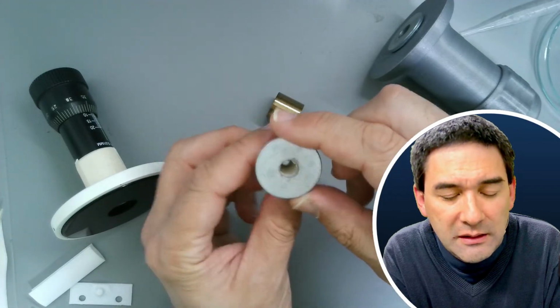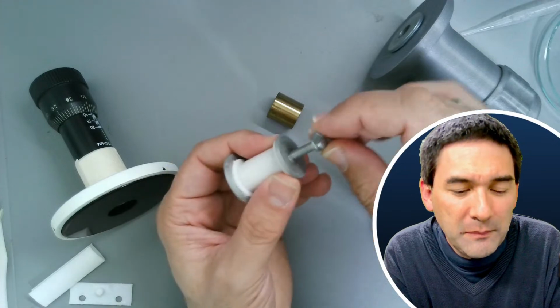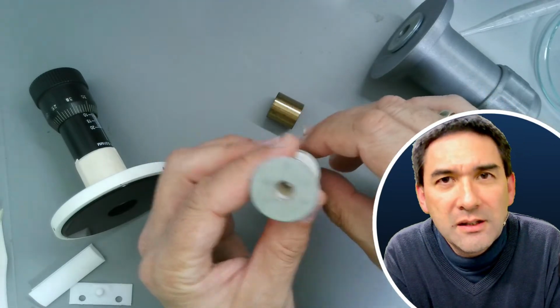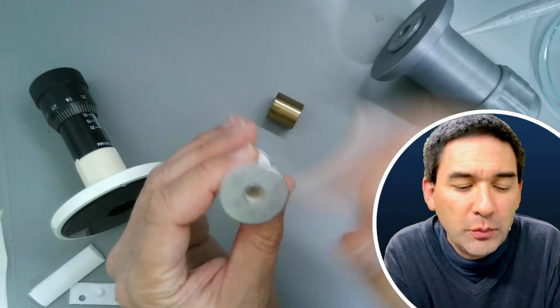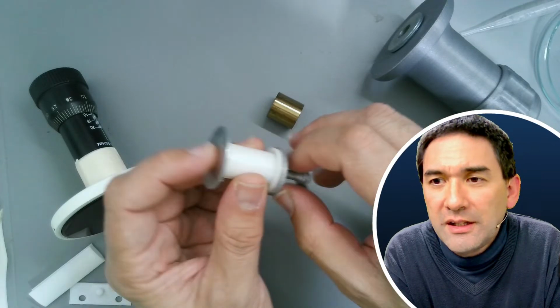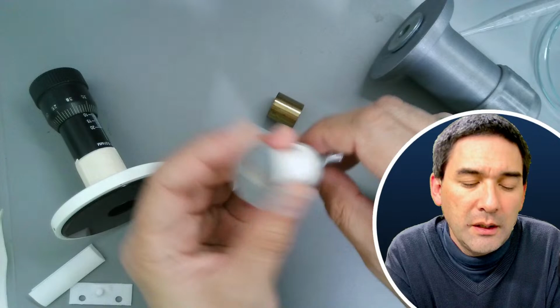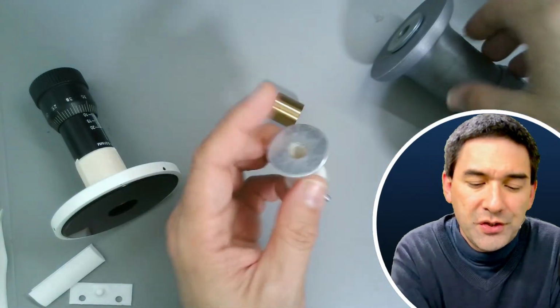And that's it. And as a matter of fact, it does work. Okay, it's not very stable. It's a little bit wobbly, as you can see here, but it does its job, and actually I'm getting better cuts than just trying it without this. Okay, so this is essentially the first one that I've made, and then I've got a few others here as well.